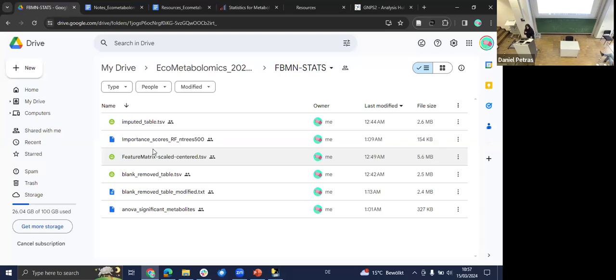You cannot directly do it. You have to submit to statistics, and then you have to download the table. So for the purpose of time, I already downloaded it. This is something you could use for the next session with Daniel, incorporating this information into Cytoscape again to bring everything nicely together. I also performed some ANOVA and random forest, which we can do now as well.